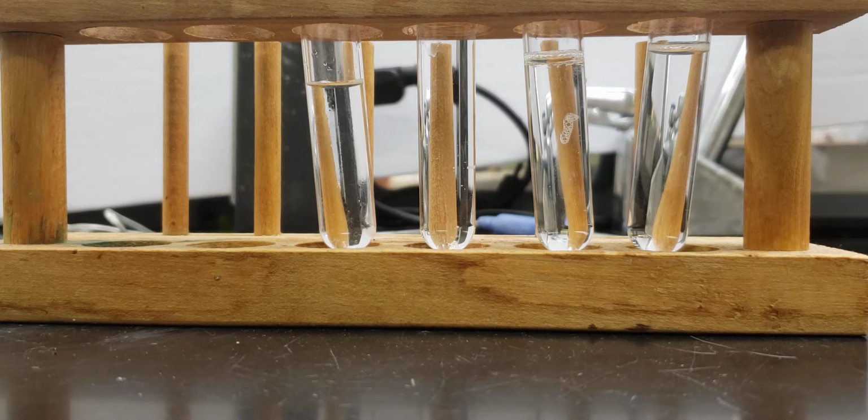If we have any other halides in there, the silver is going to attach to the halide, and when it does that, it will not dissolve in the solution anymore. An example would be that if there was chlorine in our test tube, the silver would bind to the chlorine, precipitating out of solution and making a solid.